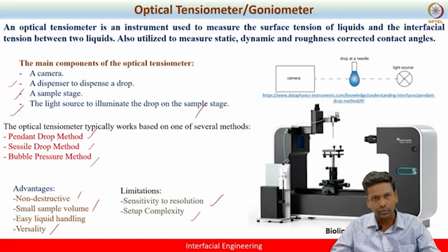These counteracting forces make the droplet a little bit distorted. So it will not be spherical. The droplet will be in a pendant shape, mostly, because of these forces acting on the liquid.